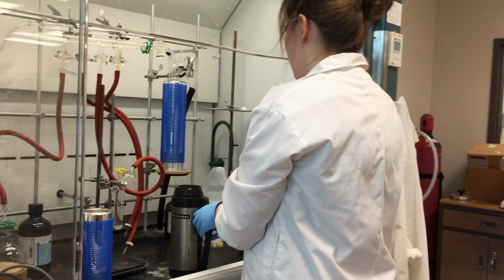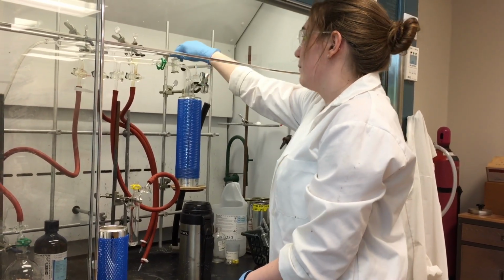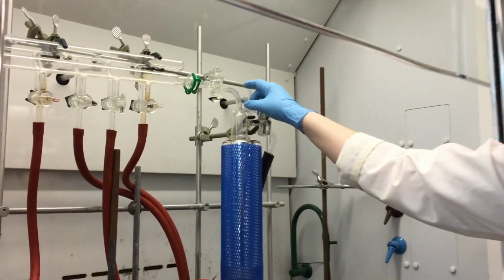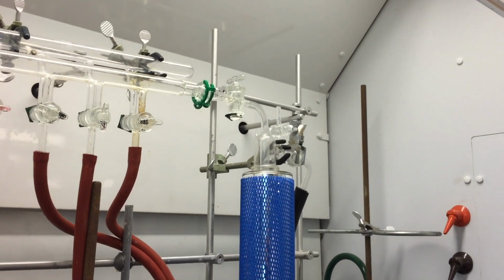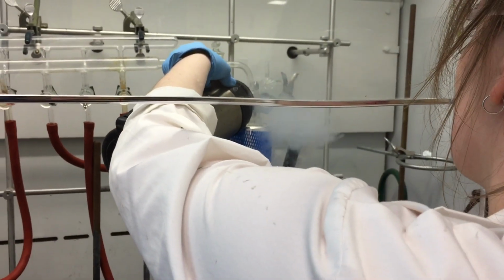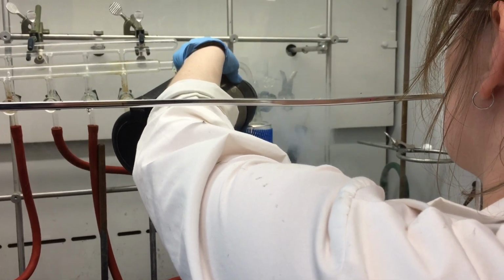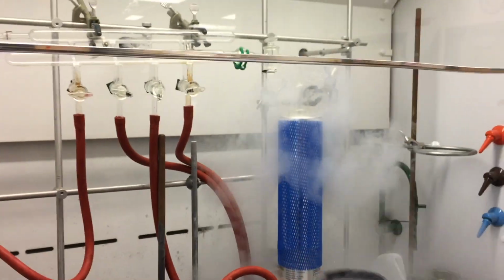So before you turn the vac line on, you're going to close both of your taps. There's one tap that leads to the Schlenk line and one tap that leads to the atmosphere. You want to make sure both of them are closed. So you're going to pour in the liquid nitrogen. Okay, and then I'm going to turn on my vacuum.